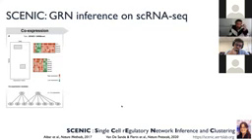So now, further, we can ask, now that we have the RNA data and the ATAC data in each cell type, can we find relevant transcription factors? If we use the single cell RNA-seq data, we can use a method called SCENIC that was developed in the lab by Sara. So I'll go through that briefly. In SCENIC, we first define modules of genes with an upstream regulator transcription factor. These modules are built using GENIE3 or GRNBoost. This is a random forest regression method whereby the genes are predicted target genes of the TF because there is co-expression or co-variability, this can also be nonlinear, between the transcription factor and the target genes.